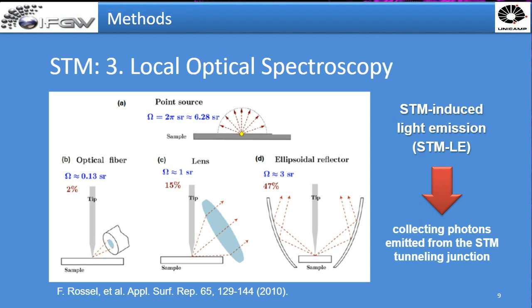And in some other geometries, people have tried to use some kind of on-axis mirrors, but they impose several restrictions on the instrument itself. You can imagine that in this case here, the whole mechanism for moving the tip is on the light path, so you can lose a lot of light.